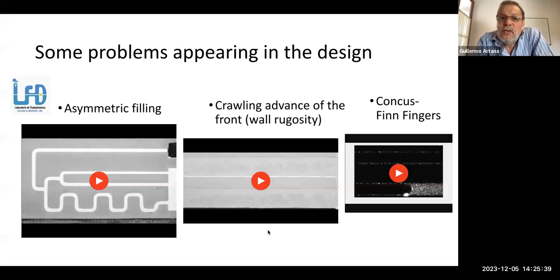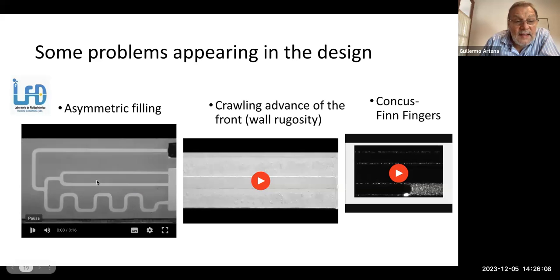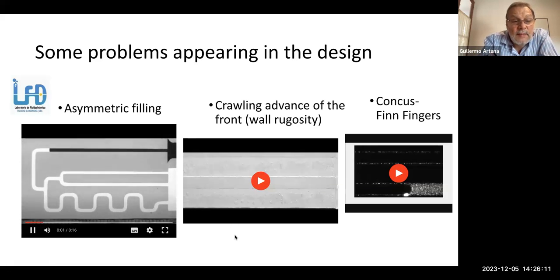There are some aspects that appear in the design, as we don't have any tuning parameter. What we have to be quite sure about is the correct design of the chip, so that what we wish to occur happens. One of the problems that appear with this kind of devices is that you may have asymmetric filling.